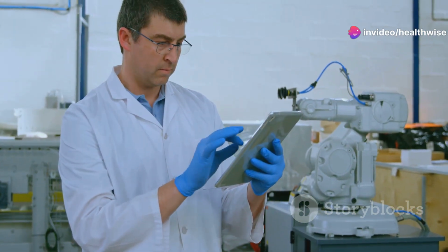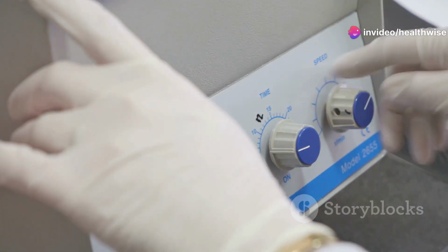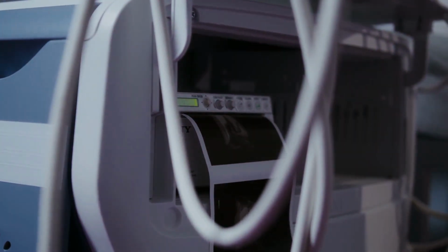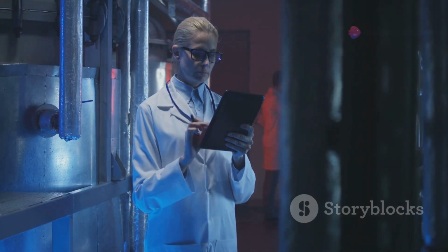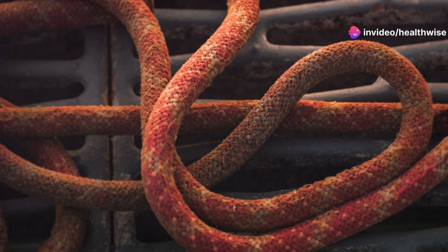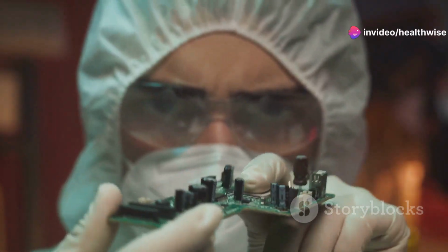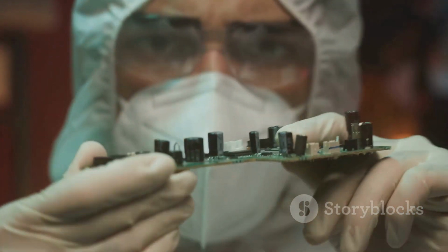Calibration is also essential. Sensors and controls must be checked and adjusted to ensure they are providing accurate readings. This helps maintain the stability of the internal environment. Another key maintenance step is to check for wear and tear. Components like seals and heating elements can degrade over time. Regular inspections can identify issues before they lead to failures.